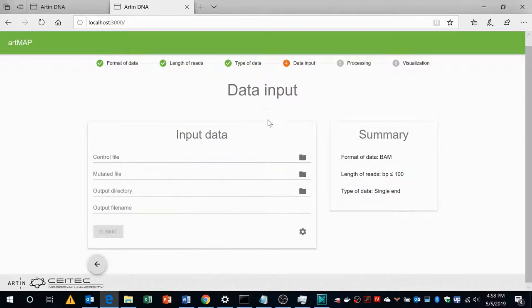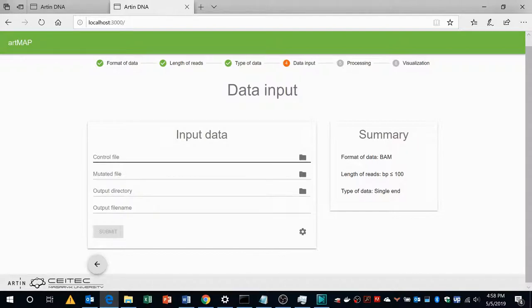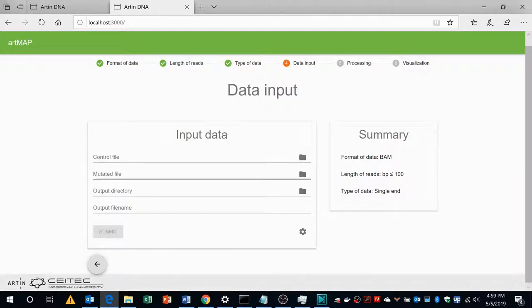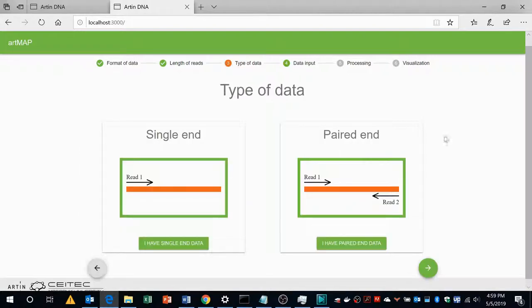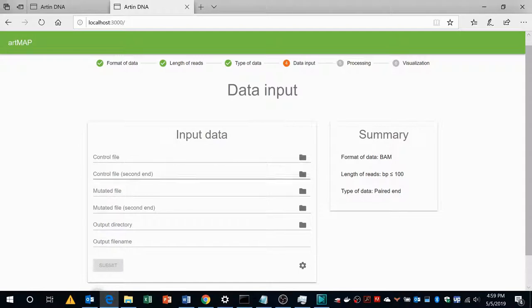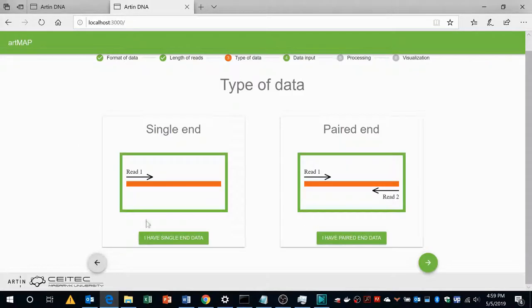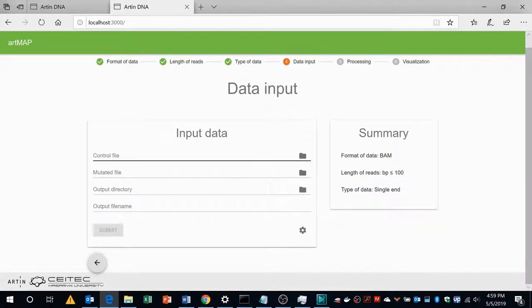Then it will ask about the data input, where are the files present and where do you want to store the result and what will be the name of the output file. If it is a single end data it will ask you to upload single control and mutated file. However, if the data set is paired end then it will ask you to upload two pairs of control and two pairs of mutant file. In our case the data is in single end so we will just upload single control file and single mutant file.